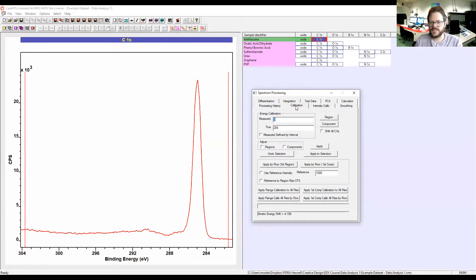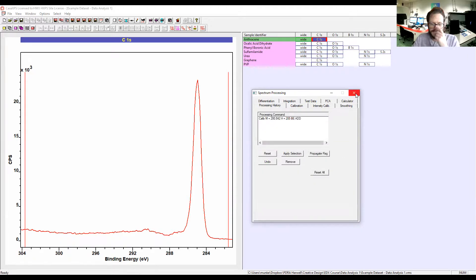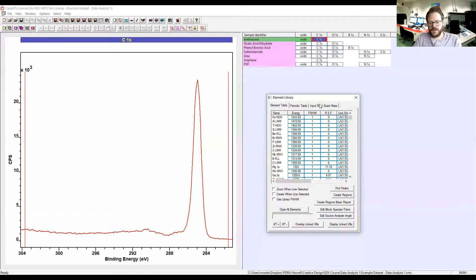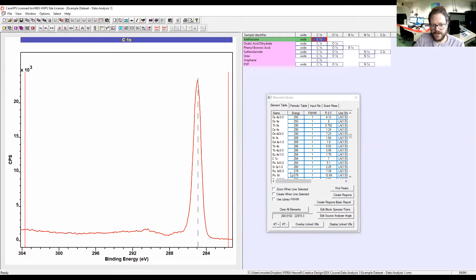The processing history tool is quite a good way of just wiping the slate clean. And finally, the Library. As we saw earlier when we input the file, this has got information on all kinds of peak positions and energy. If we click on here, we can see the peaks that come in this general area. Here we've got carbon, this is the peak that we're looking at, and other possibilities are listed here. You can use your own discretion at figuring out which one is the most sensible.